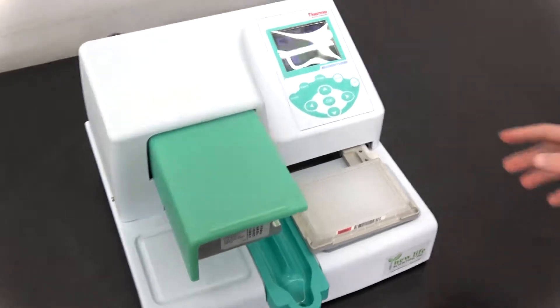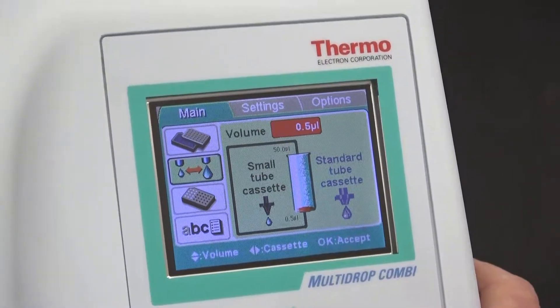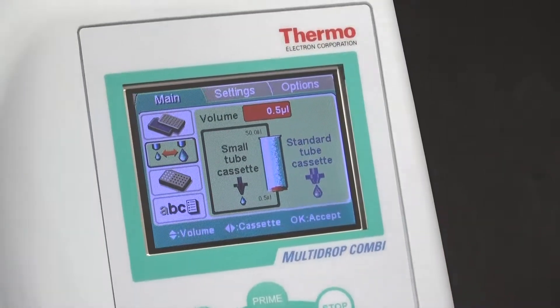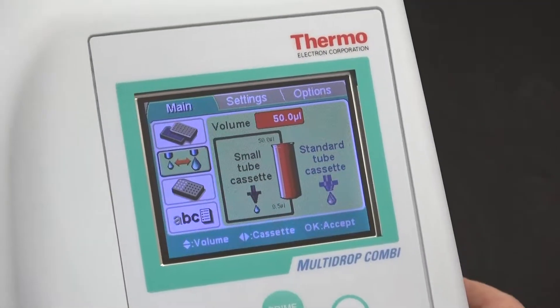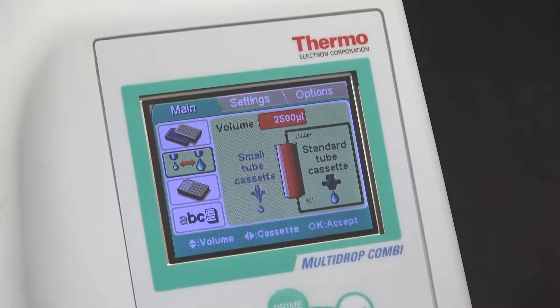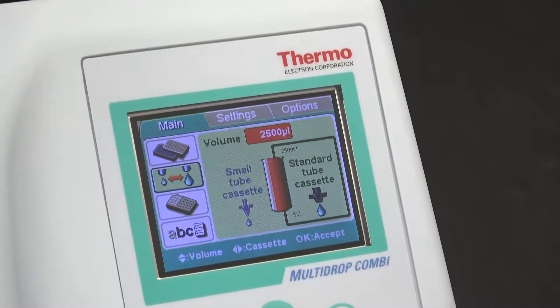It's really simple. You've got a small or a standard tube cassette, and there are volume limitations depending on which cassette you're using. The highest volume you can configure this for with a small tube cassette is 50 microliters, but this goes all the way down to half a microliter per well. And then there's a standard cassette which goes all the way up to, absurdly, 2,500 microliters — quite a substantial volume.